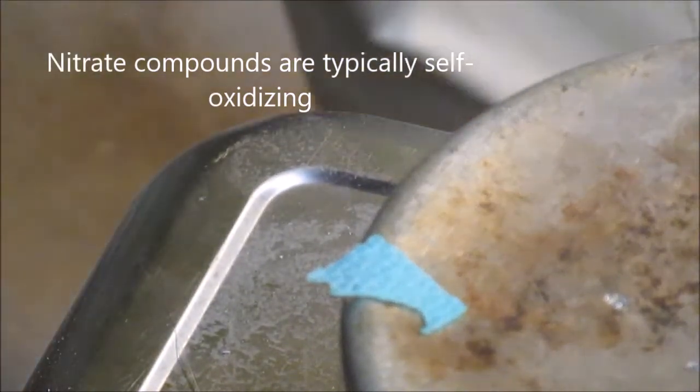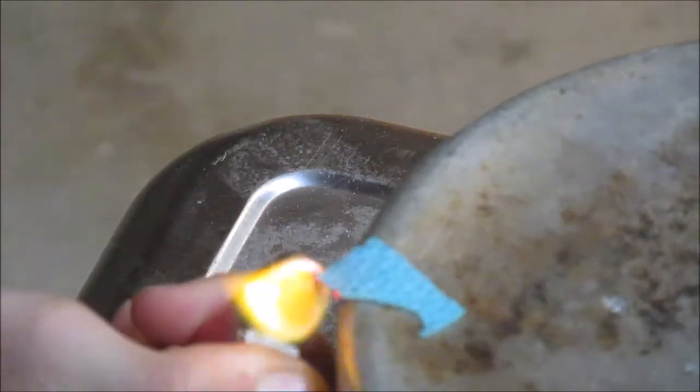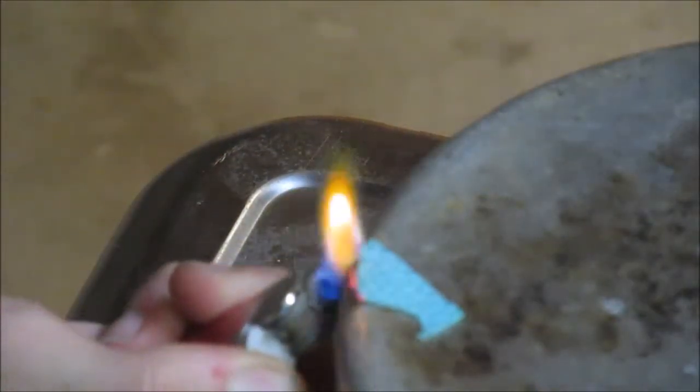We first performed an open flame test. This rapidly released copper ions from their nitrate bonds, which oxidized in the high temperature environment, giving off a green patina hue.